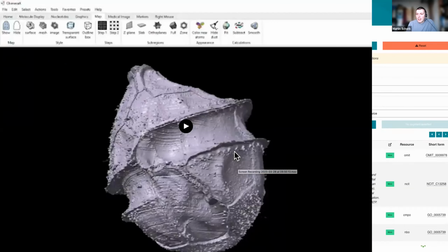Properly means that the colors are the same as in the original segmentation. The spatial relation is the same. So you could probably think of having done the segmentation in a downsampled volume, but still it's registered in the correct way now. So this is part of the development that we've done with that particular data.